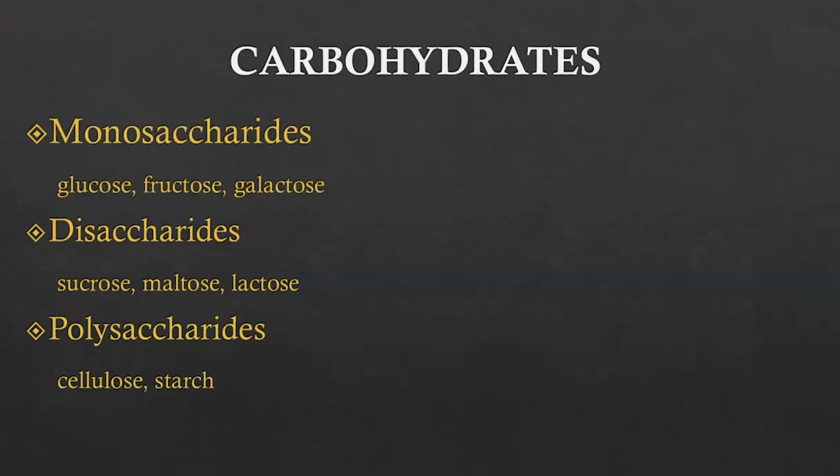Before beginning this section of the module, be sure that you have completed the Benedict's test for reducing sugars section to provide fluidity to the concepts presented here. Of the three classes of carbohydrates, the hydrolysis experiment places emphasis on disaccharides.